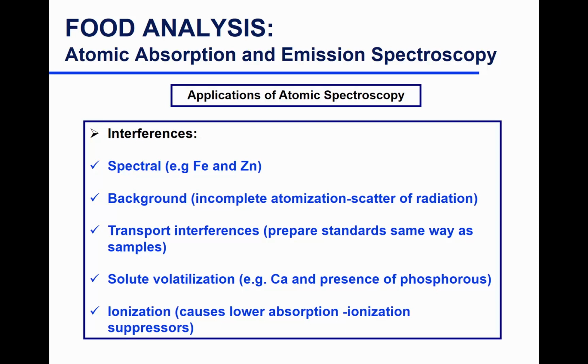So in this case, specifically for the analysis of iron, I select a wavelength that's not necessarily the optimal, but something that still gives me an absorption. And same for zinc, selecting a different wavelength, not necessarily the lambda max.